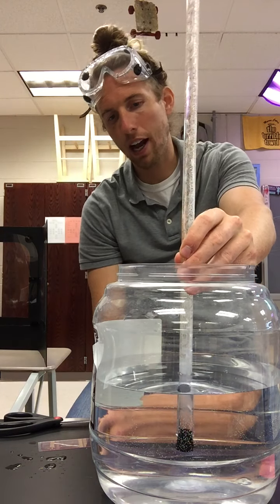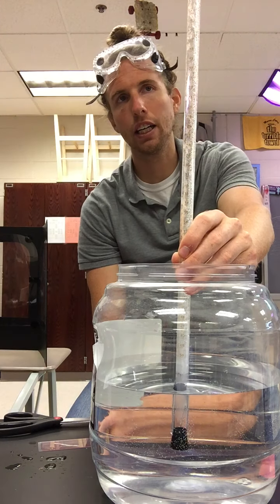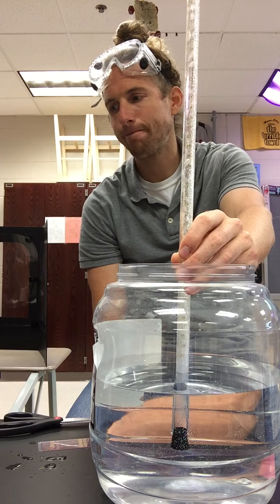All right, stay with me here as we allow this magnesium to continue reacting. We're still giving off bubbles.